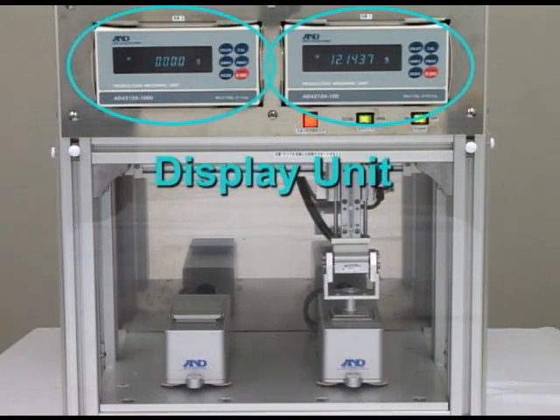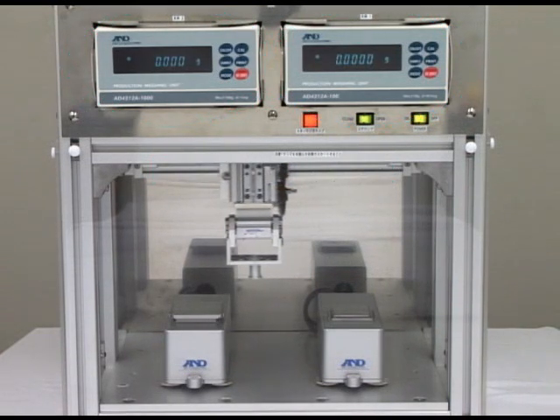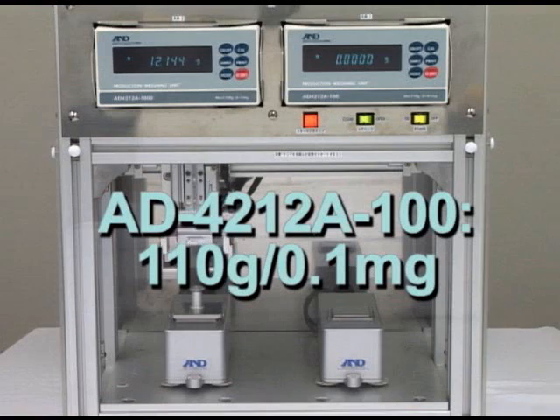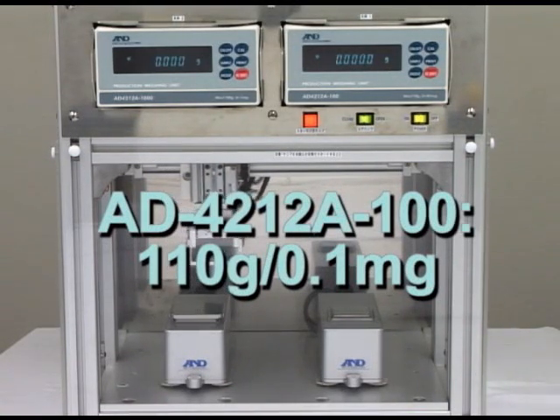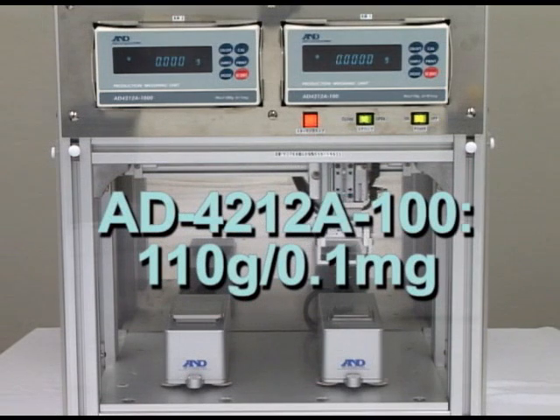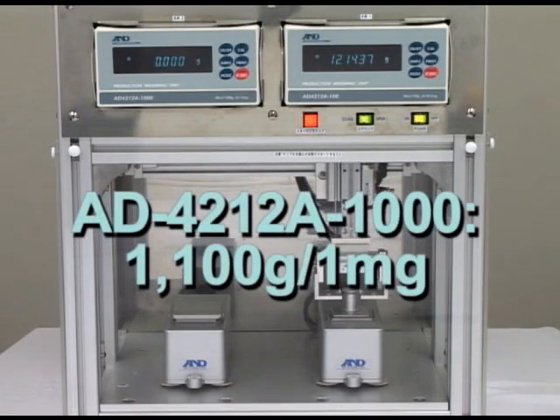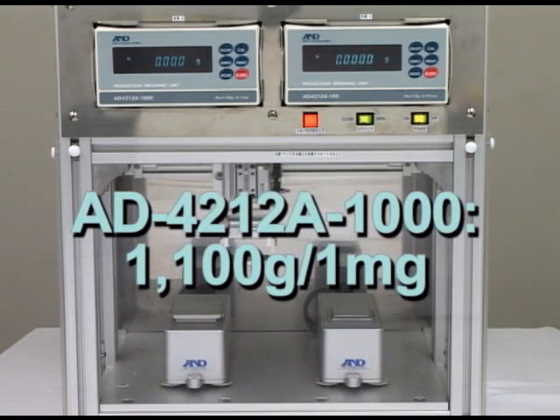Using this series you can create your own precise weighing system. The weighing capacity of the AD4212A100 is 110g and its minimum weighing value is 0.1mg. The weighing capacity of the AD4212A1000 is 1100g and its minimum weighing value is 1mg.